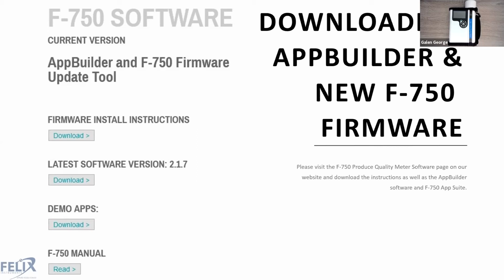You just have to download the instructions, and then you'll want to download the latest software version, the demo apps, as well as the manual, and the instructions will tell you from there how to go about installing AppBuilder, installing the new firmware on your device, and putting the apps onto your instrument. The manual, as well as a series of tutorial videos, will be available to help you get familiarized with AppBuilder. And obviously, if something's not working with your instrument, please contact our support team, and we will be happy to help make sure that you can get onto this new firmware.